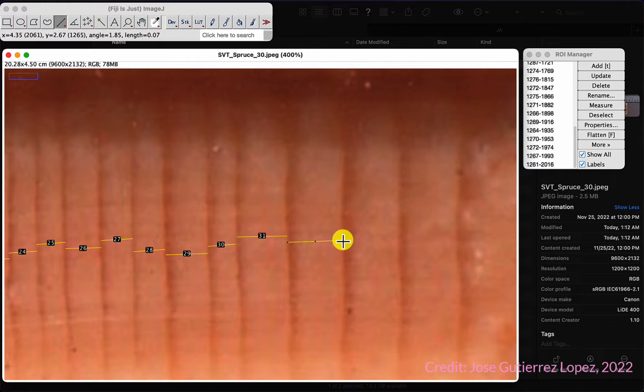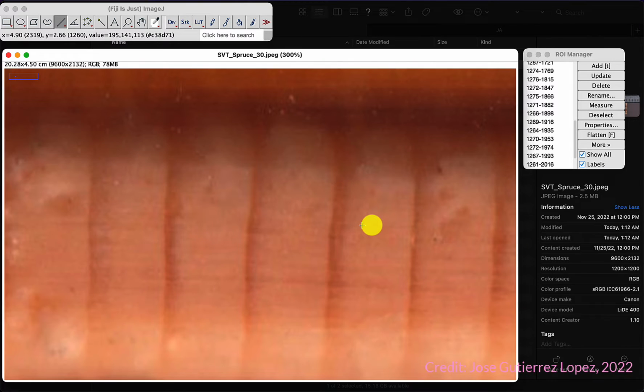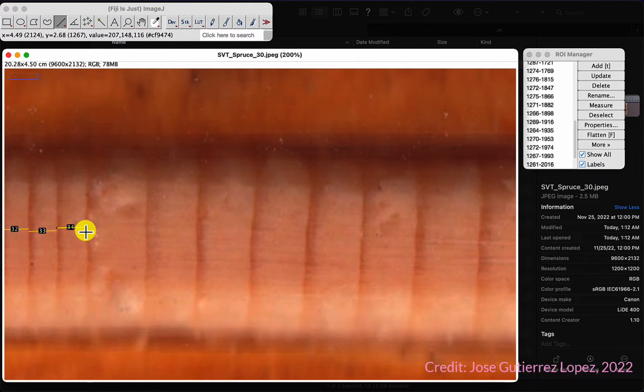And as you can see, I'm going in some sort of a zigzag pattern, because personally I find it really difficult to start right there. I always end up pulling the previous line, so instead I do what you see me doing right now, which is one on one side, the other on the other side, and so on. I find that easier. There. And when the rings are big enough, you have the luxury of making micro errors, and it is okay.